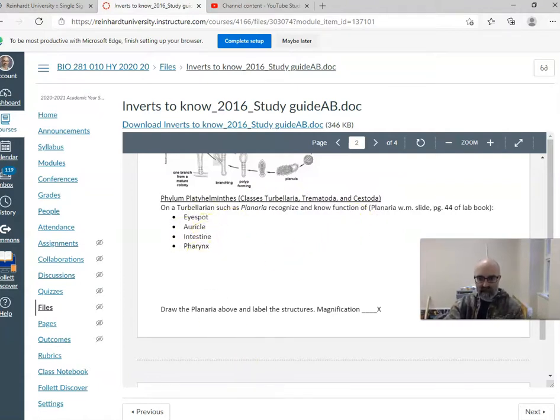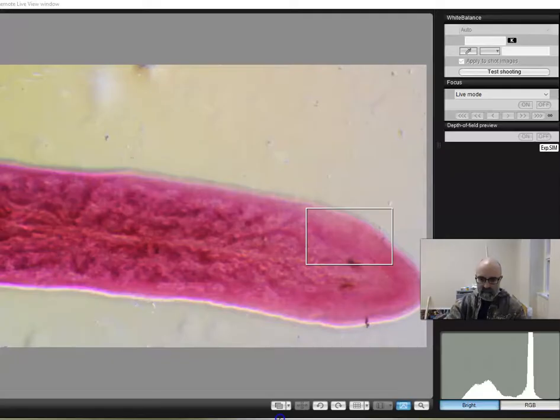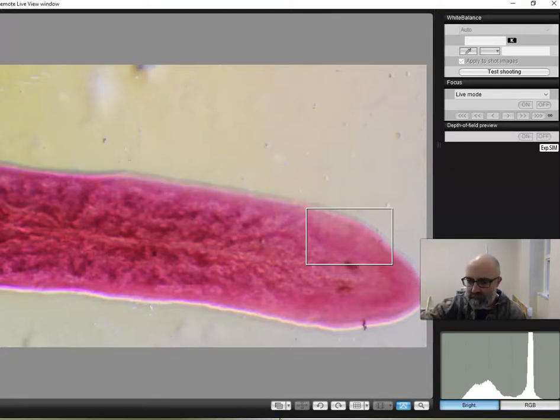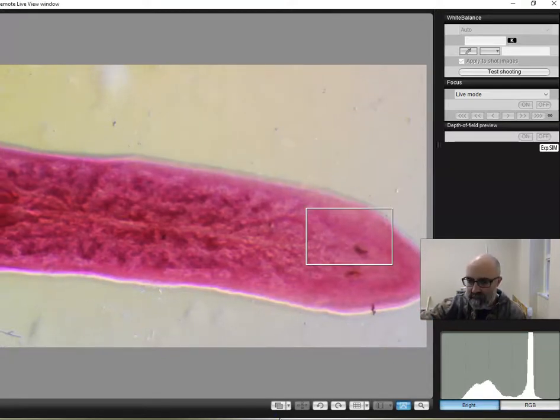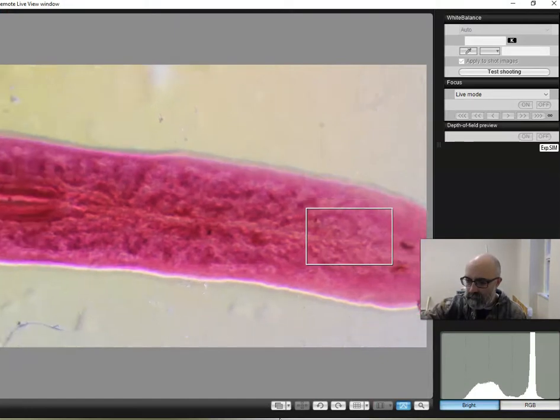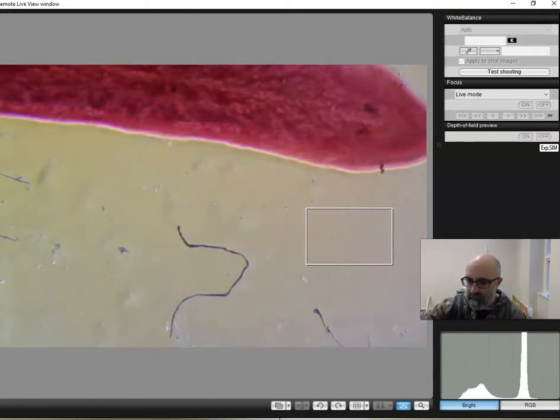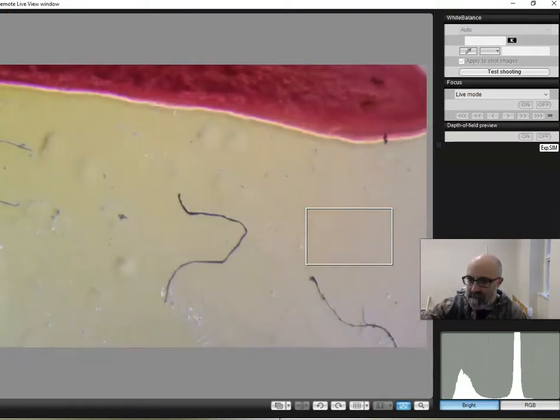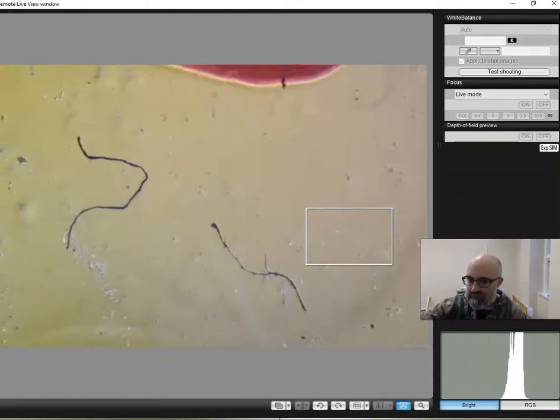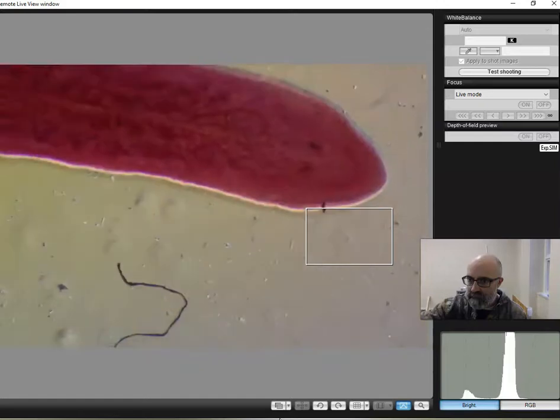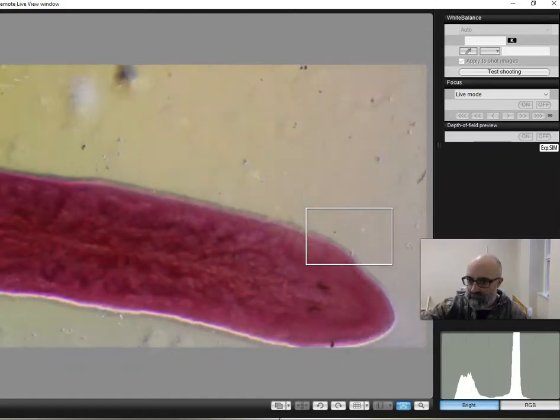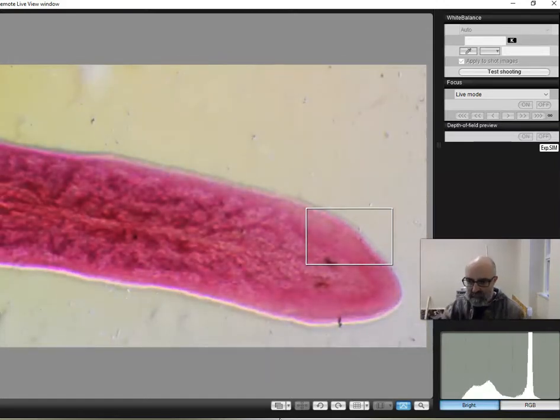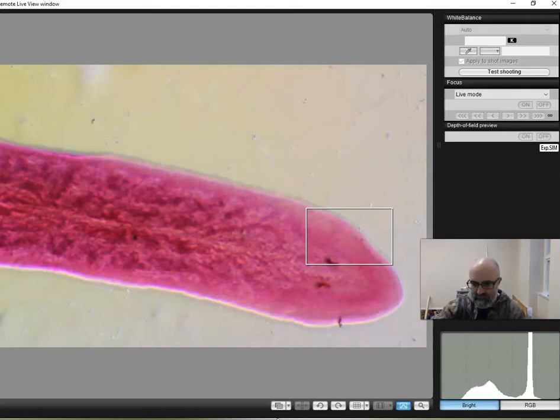So we'll start with planaria, which you see here. That's in the turbellaria. It is a free-living organism. You can find these around here, actually. This is the front end, or the head end. So they are cephalized. They do have a front and a back end.